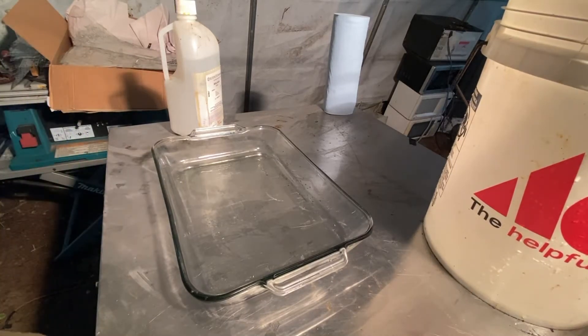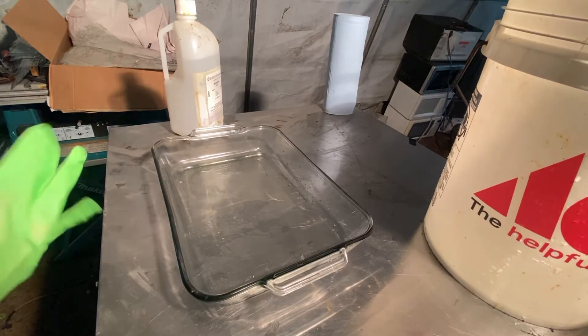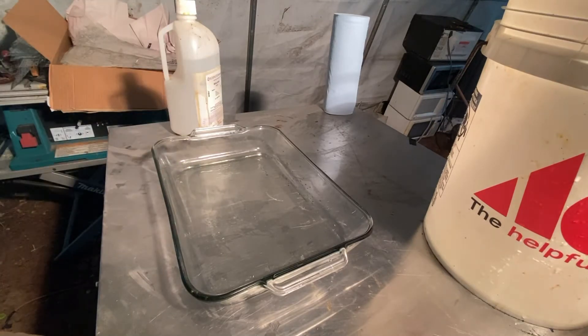All right, we're gonna do some keyboard mylar silver recovery, something I've actually never attempted before in my life, so we'll see how it goes.